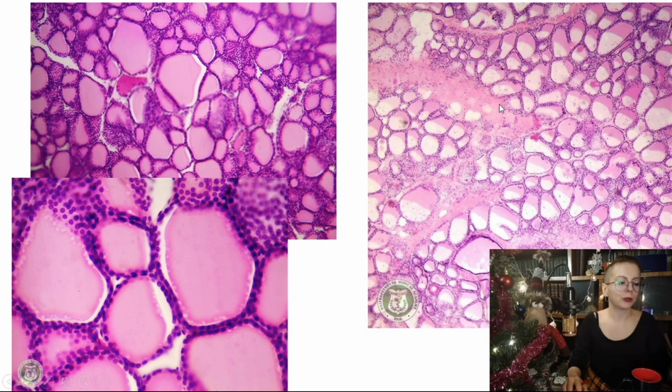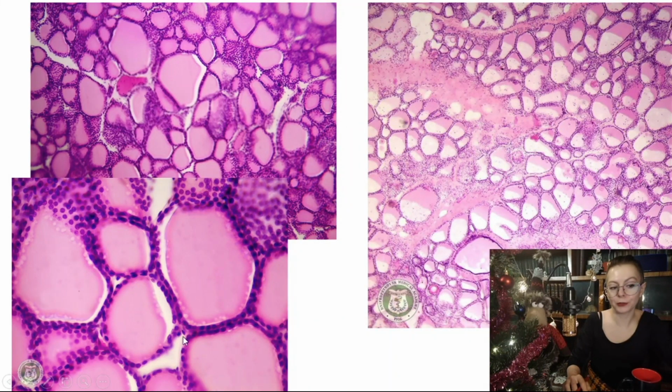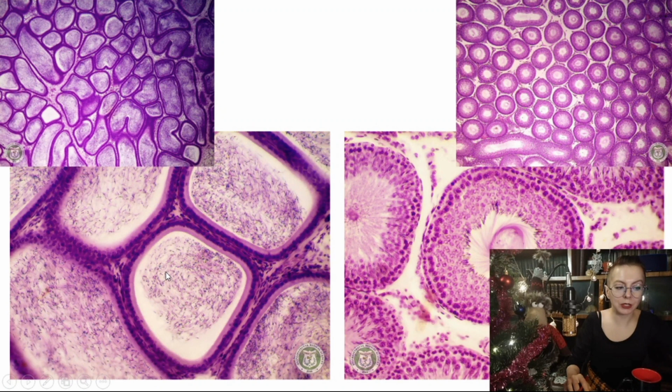And also connective tissue. After that, mammary gland also could be confused with the epididymis. Epididymis is also represented by spherical ducts. Look like here, for example, yeah? But in thyroid and mammary gland, there is the oxyphilic secretion and it is homogeneous. There are no cells inside. But in the epididymis, there are cells. You can see those small dots. These are nuclei of spermatozoa. So in the epididymis, spermatozoa inside, while in mammary gland and thyroid, there is homogeneous secretion.